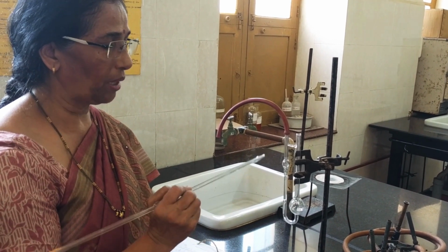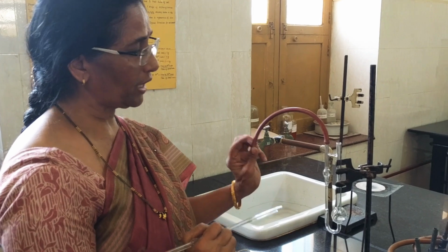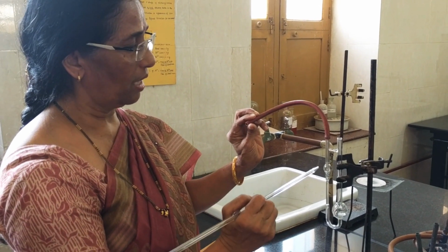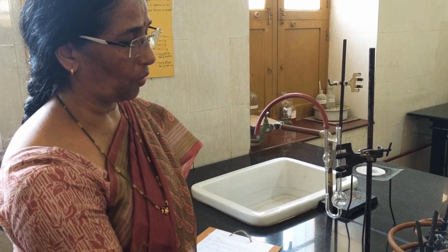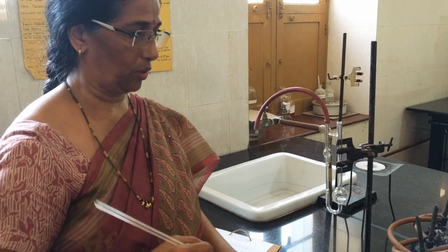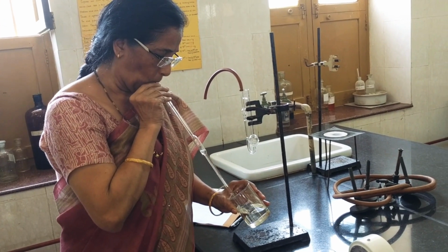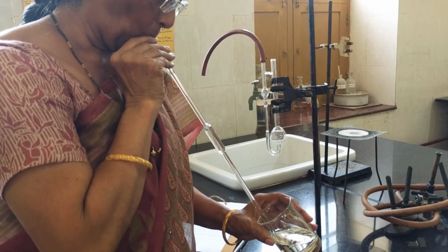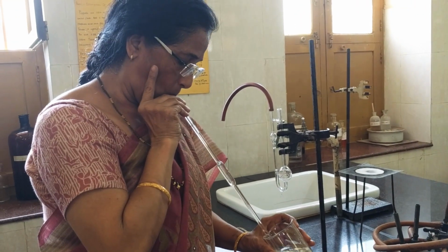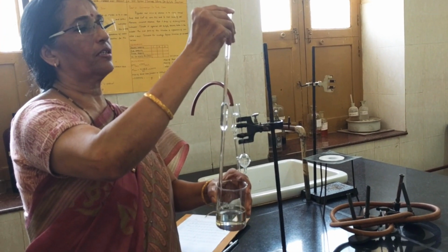Since I need to repeat this experiment, repeating it is very simple, because every time it is the same thing: I have to suck the liquid, make it flow from here to here, and determine the time of flow in seconds. So let me do this. So I have taken 10 ml of the liquid.